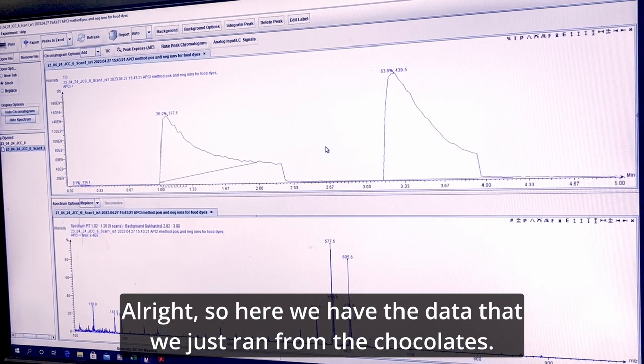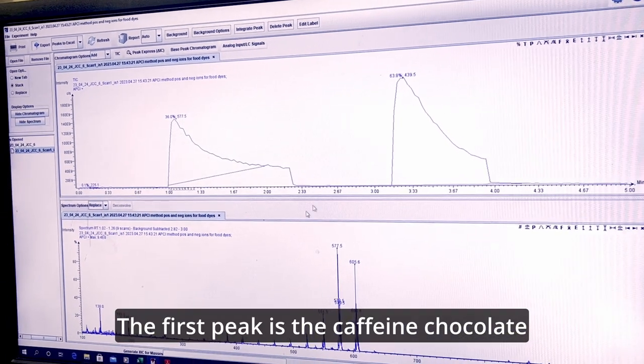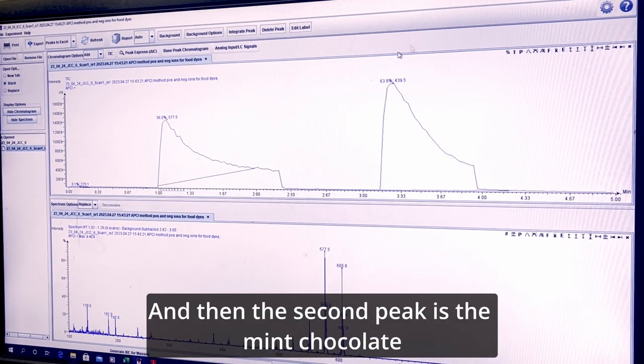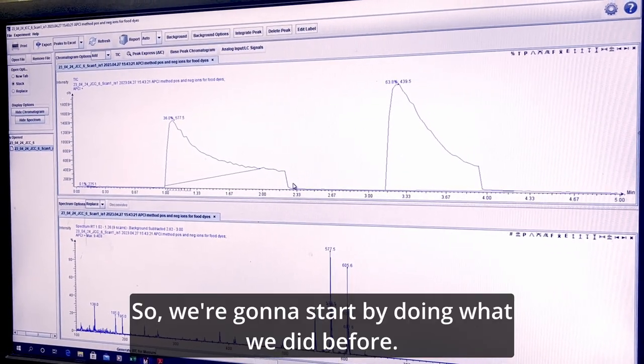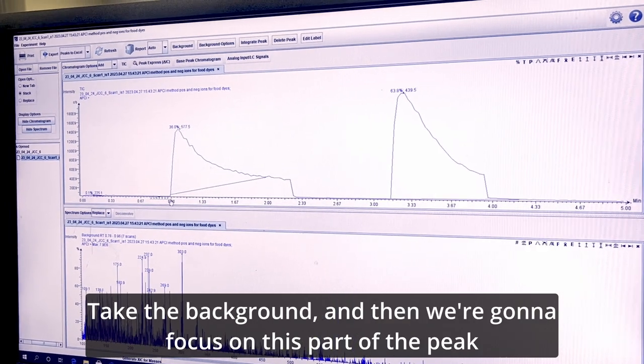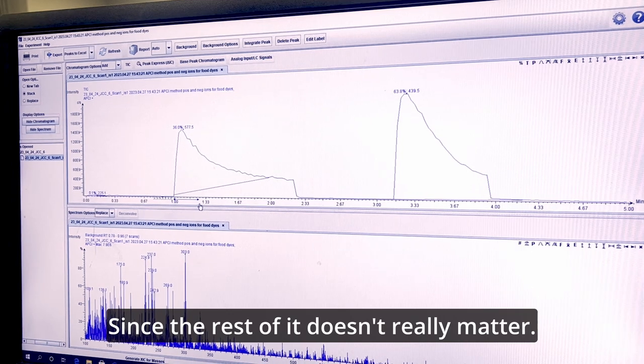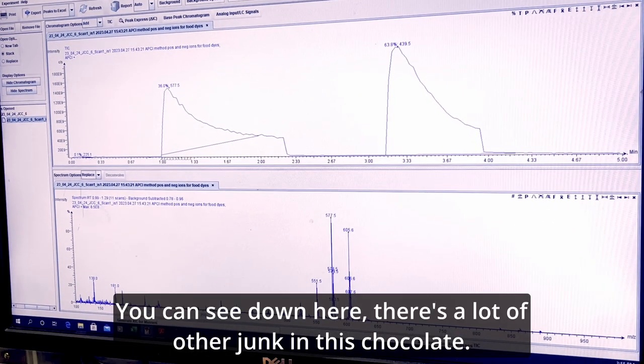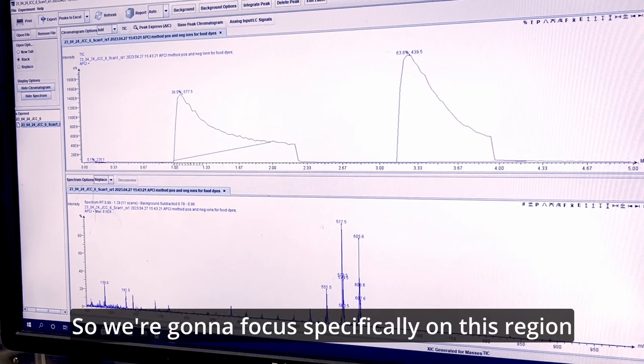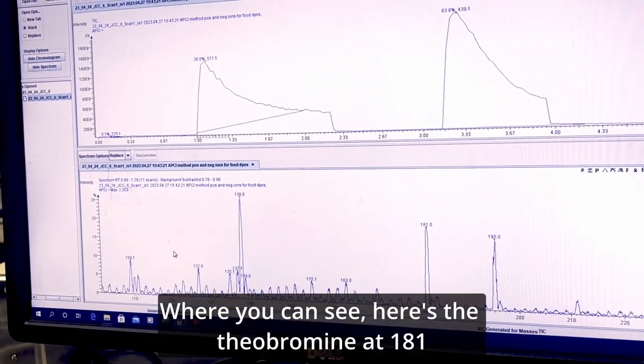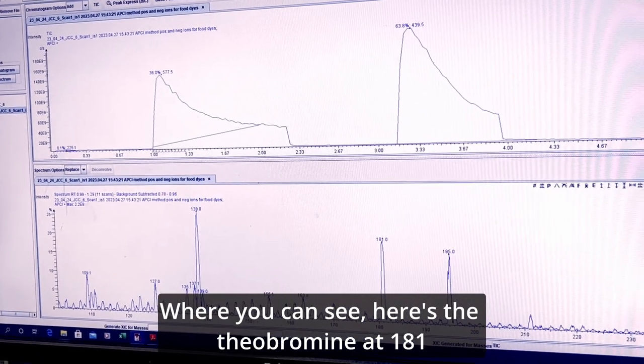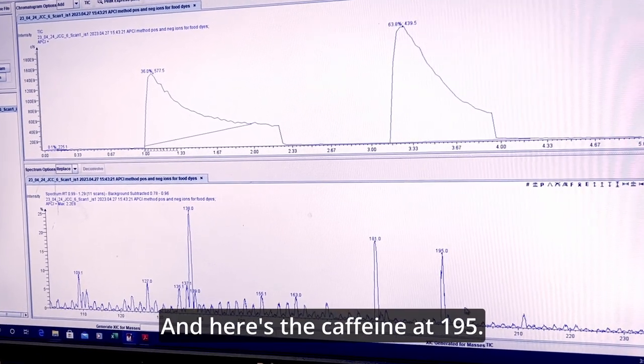All right. So here we have the data that we just ran from the chocolates. The first peak is the caffeine chocolate, and then the second peak is the mint chocolate. So we're going to start by doing what we did before, take the background, and then we're going to focus on this part of the peak since the rest of it doesn't really matter. You can see down here there's a lot of other junk in this chocolate, so we're going to focus specifically on this region where you can see here's the theobromine at 181, and here's the caffeine at 195.